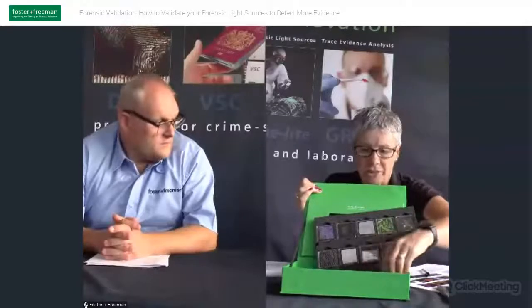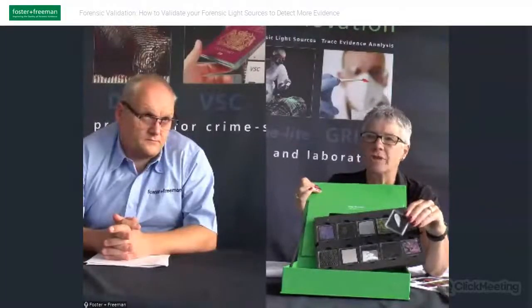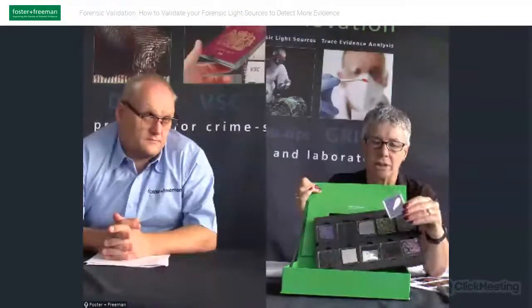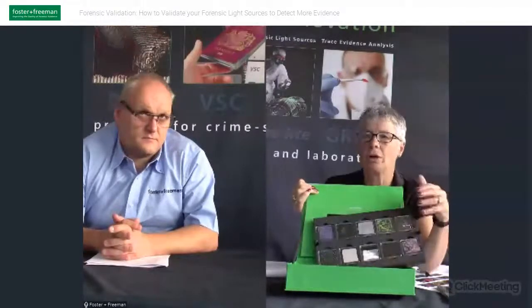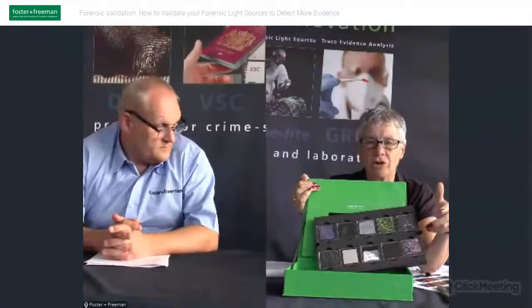And we've got the example of very good use of the oblique light source with the microsil fingerprint. So this is a nice example to use your equipment to also assist in training, really useful training aid.